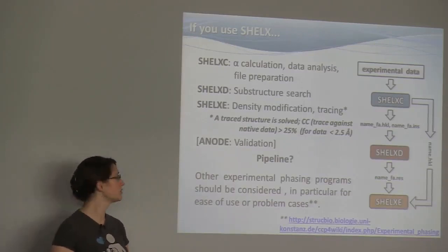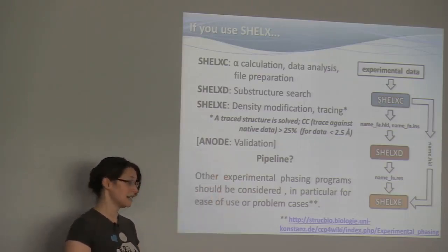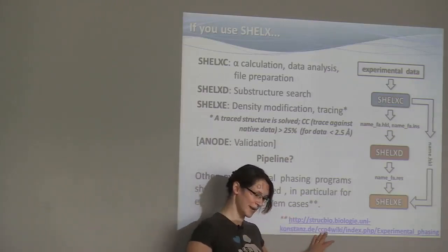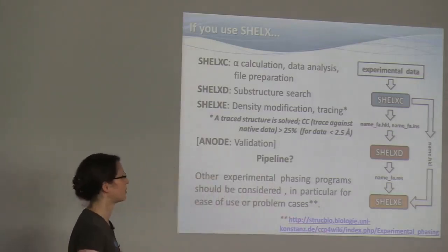There's a lot of useful things also for density modification. You've got Buccaneer and SOLVE/RESOLVE, and you can find a list on the CCP4 wiki. So I would really recommend to familiarize with more programs.